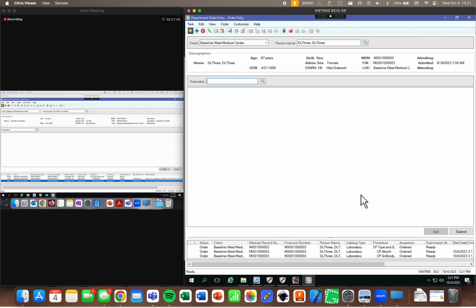Question: let's say you forgot to add the ordering physician. Is there any way to check it here? Well, since it's required, it won't really let you continue if you don't have it in there.